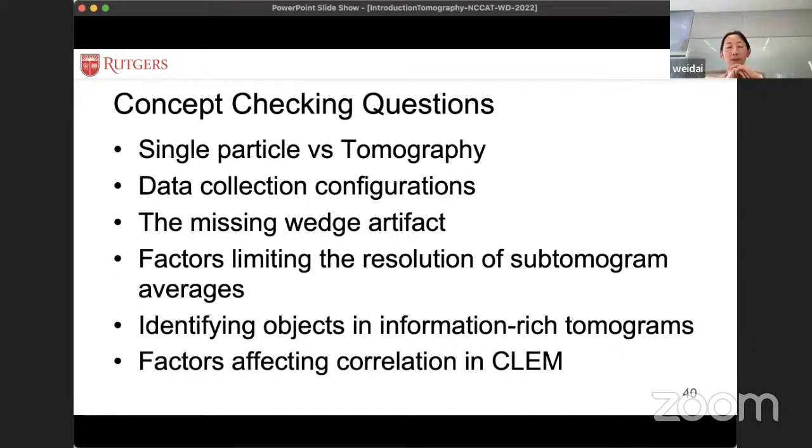There are other options. And for CLEM, if you want to track down your favorite target inside the cell, you probably want to consider, for example, the size of your target, and how accurately you can align a fluorescence image with a low mag EM image to confidently identify your target in the cell. Those also require certain knowledge and consideration beforehand, but in this lecture I just want you to know that the option is out there.